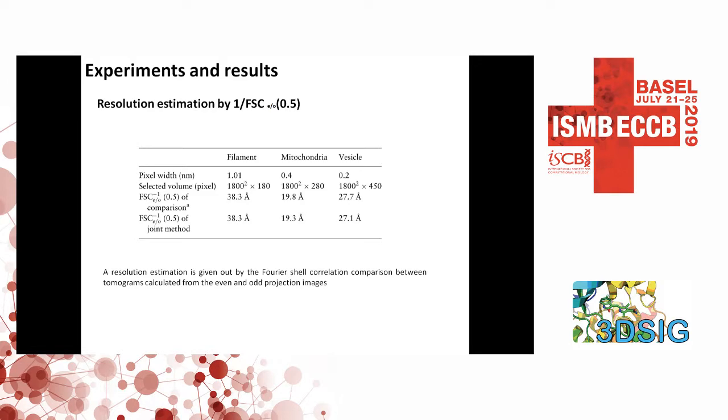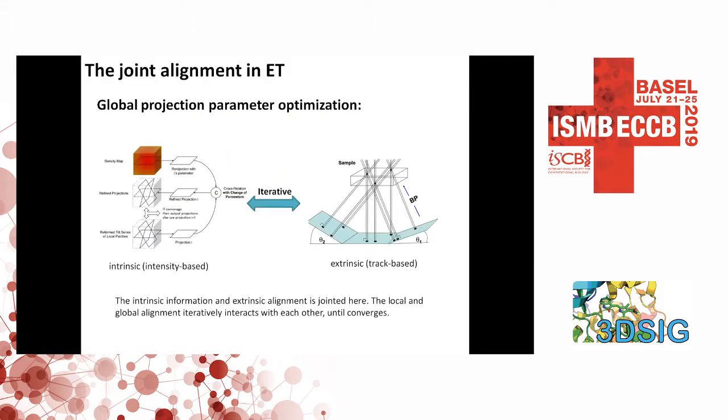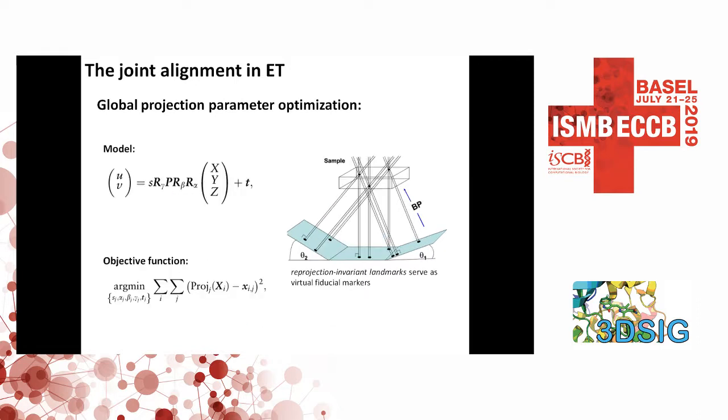When you're going back from the local patches to the global patches, I was wondering if you're able to handle some inaccuracy in the goniometer. If you have slight translational movements or something, do you need to have really a single rotational axis? Do you assume that? You mean a single rotation axis? No, the global rotation axis. Yeah, we don't fix the axis. We just use the general projection models.